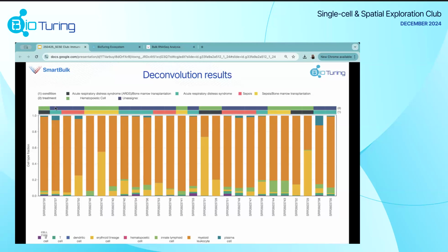You can add other clusters relating to the treatments that were used, so the post-transplant treatment or the bone marrow transplantation treatment difference, and you can see the conditions as well. What we're able to define just by looking at the deconvolution results is that these myeloid cells, especially neutrophils or monocytes, if we go deeper into the genes expressed within these samples, really dominate across very specific conditions. So these samples show innate activation in this acute respiratory lung injury model after transplant treatment.